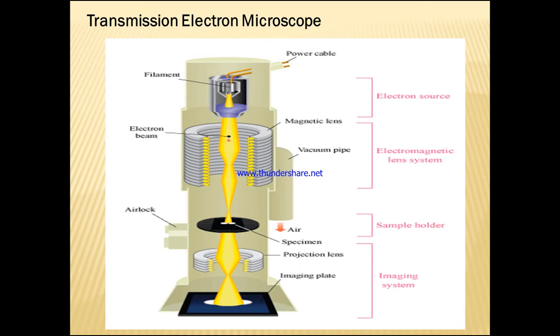So in today's session, we will discuss the transmission electron microscope. Why do we use the transmission electron microscope, and where exactly do we use it? The transmission electron microscope is also called TEM analysis. The scanning electron microscope we call SEM analysis.